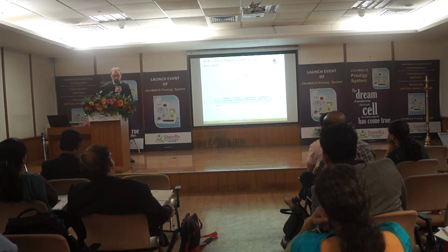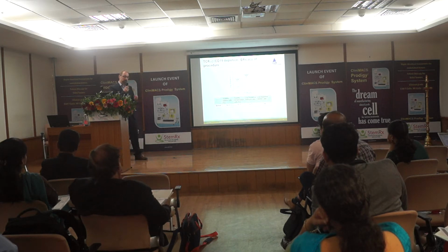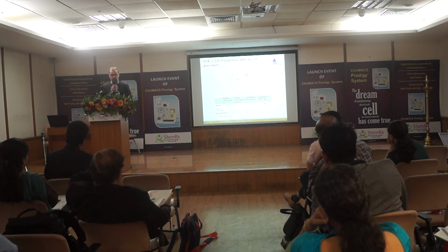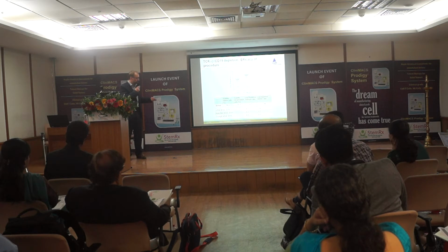Actually, on the depletion, we have experiments with quite higher depletion. Normally, the average depletion rate with log depletion is about 4. Here we have actually reached 4.75. And to get just an impression, what does it mean in different publications? This is mixed, actually, between non-malignant and malignant.